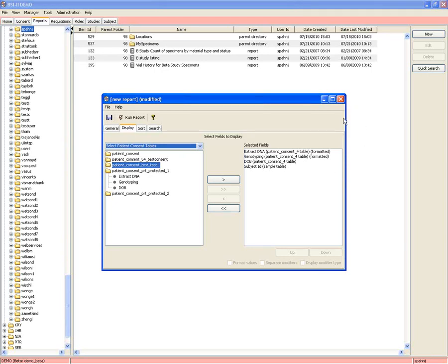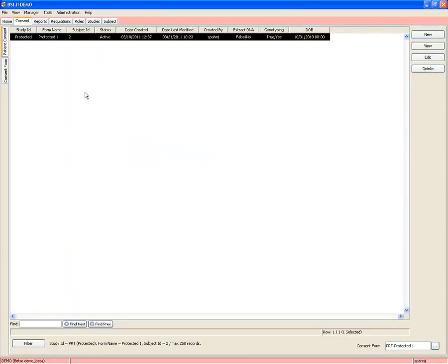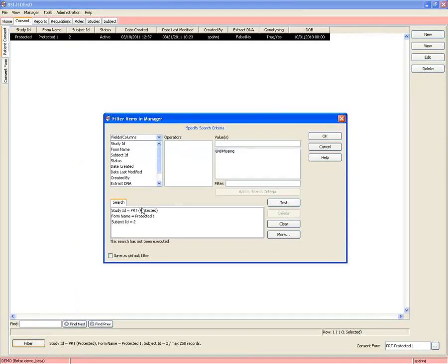If the consent version changes, I think I already answered that question. How will it affect users under the old version? The user under the old version will still have flag you in requisitions until you enter a new version for that patient.